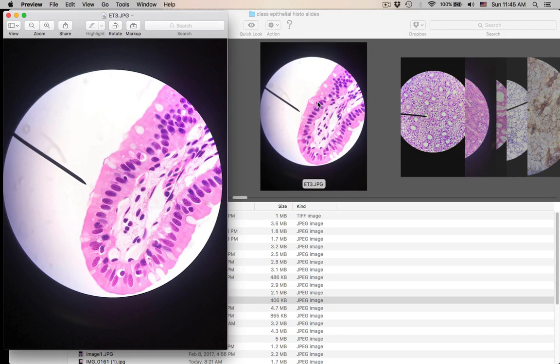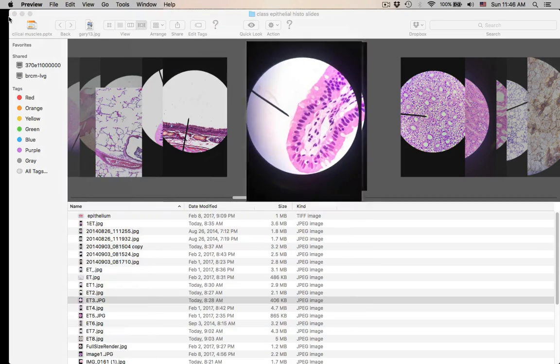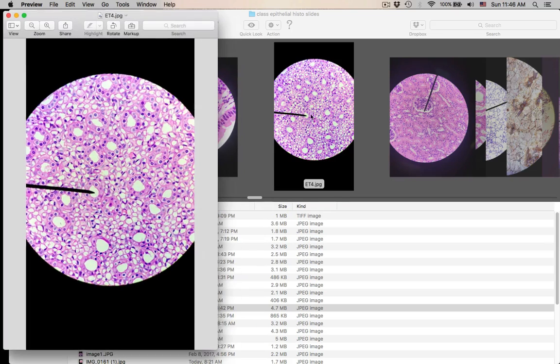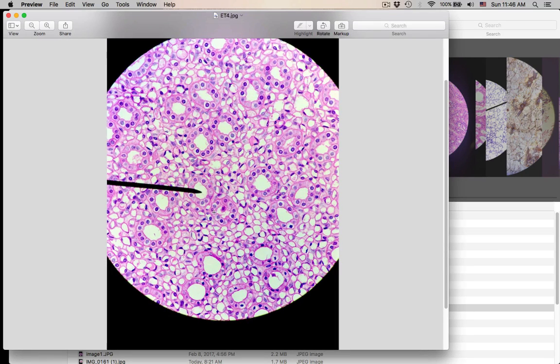Number 11, the name of these white cells. These are goblet cells. What do they make? They make mucus. And depending on where they're located, the mucus has different functions. But this is goblet cells, these white guys, making mucus. That's what they make. Number 12, easy here. Beautiful slide. The pointer is in the lumen, and this is simple cuboidal.